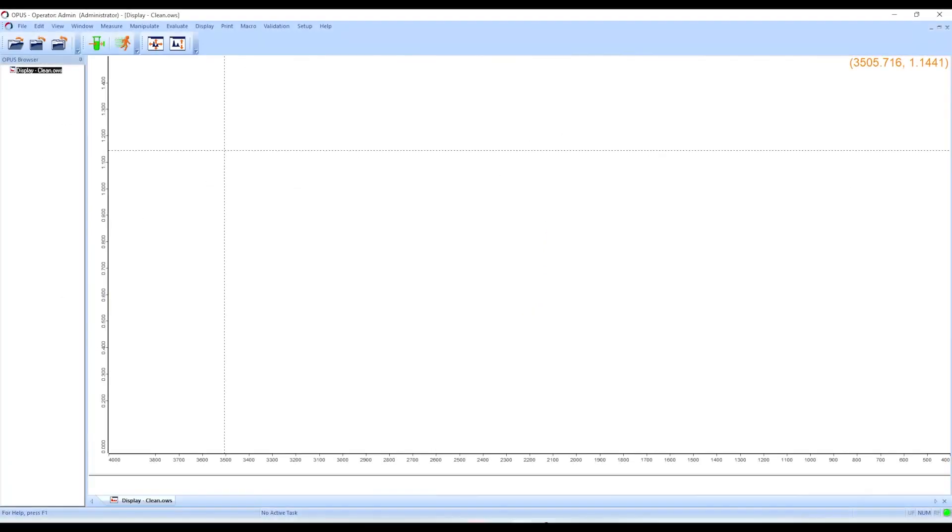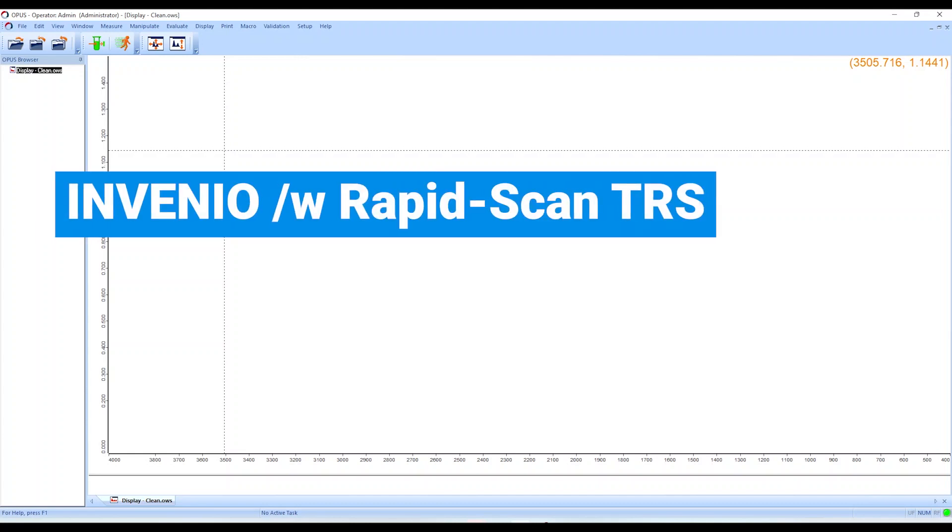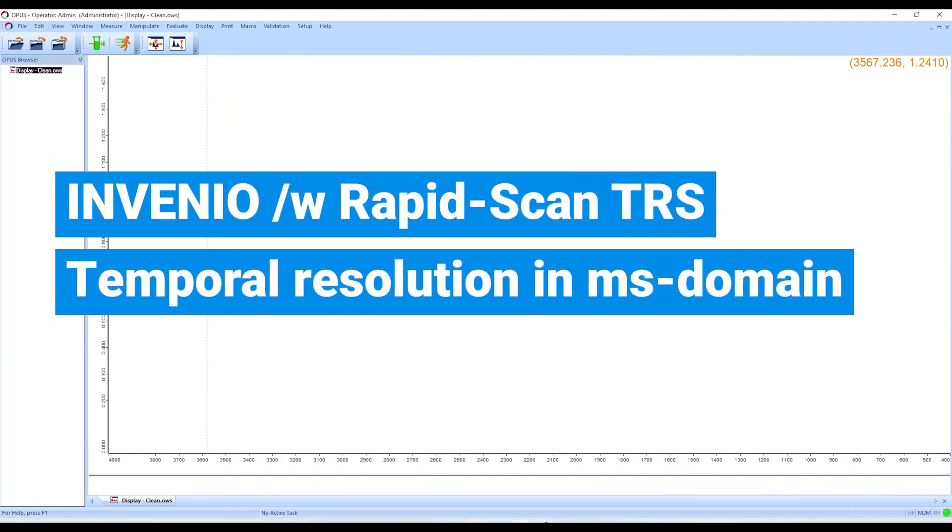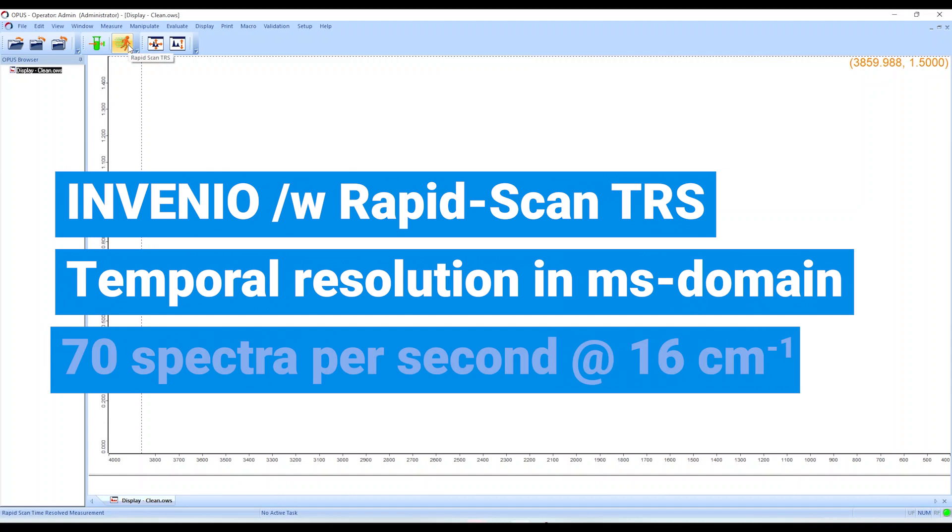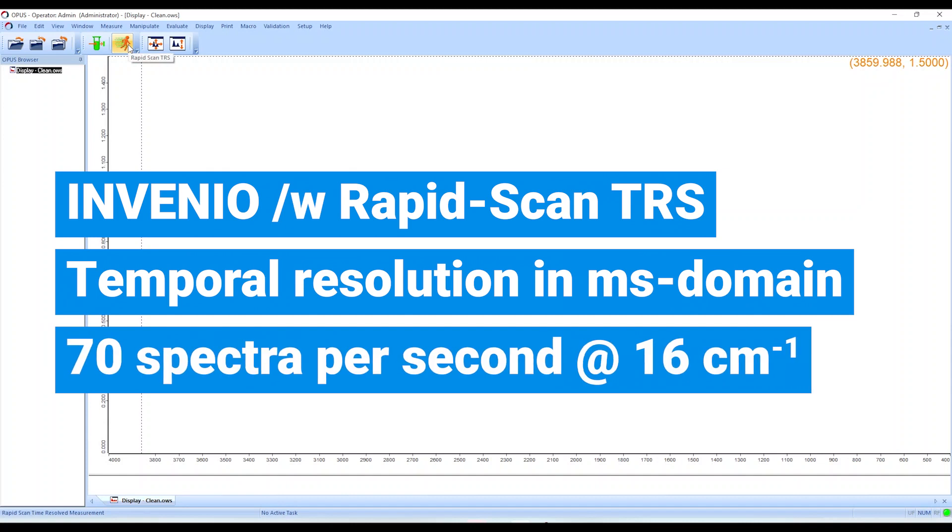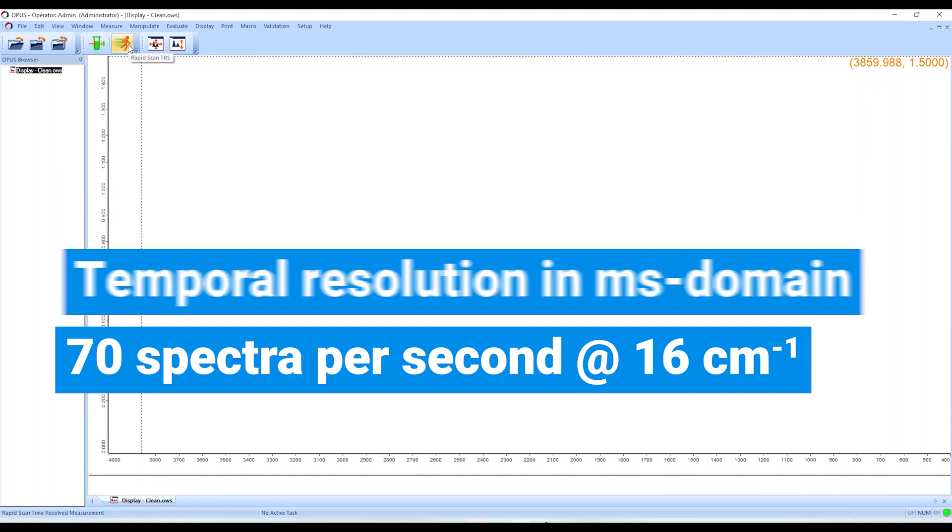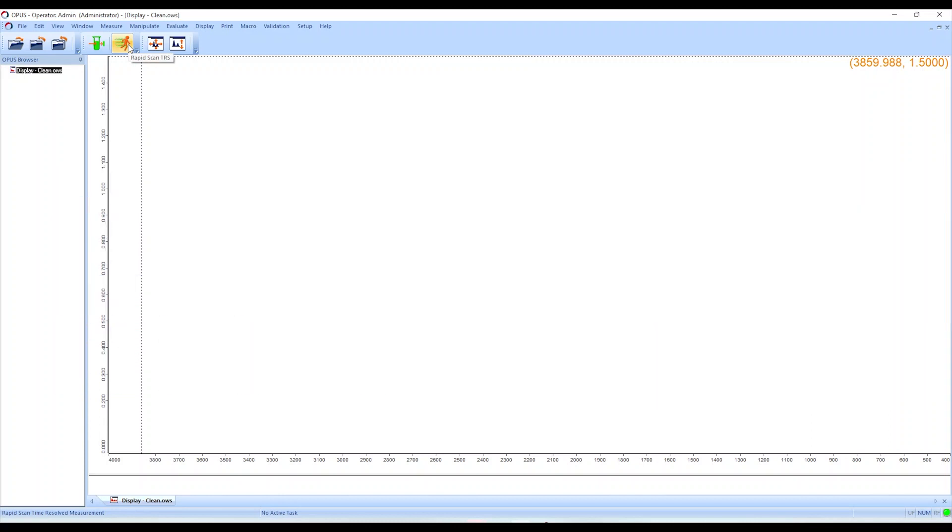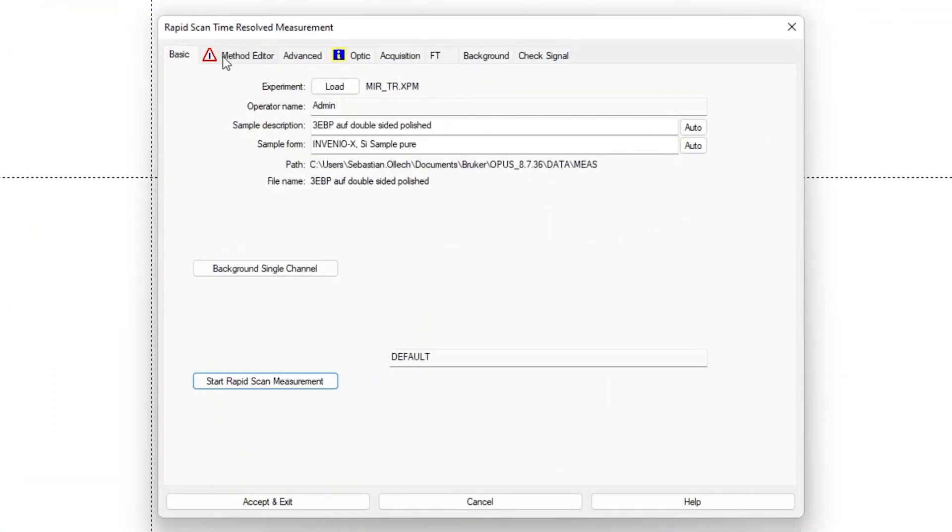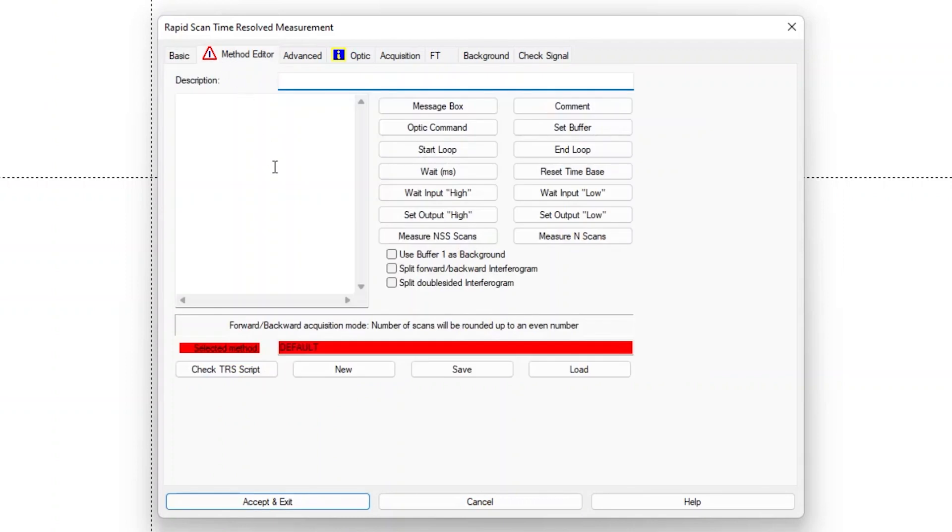An Invenio with RapidScan TRS measurement function can achieve a temporal resolution of up to tens of milliseconds, which enables to measure more than 70 spectra per second using 16 wavenumber spectral resolution.